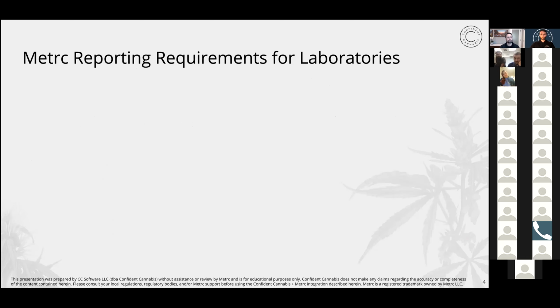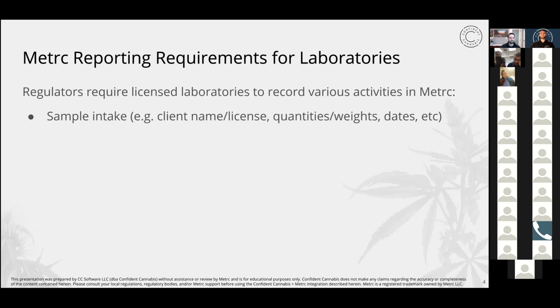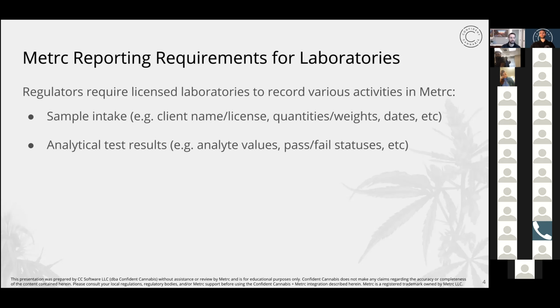So what are the Metrc reporting requirements for labs? Regulators require licensed labs to record various things in Metrc. Those things include sample intake. During sample intake, you need to record who gave you the sample, so the client and their license, the quantities and weights that you received from them, and when you received them. There are a lot of other details around transferring the cannabis to another third party. Obviously, that's what Metrc is primarily for.